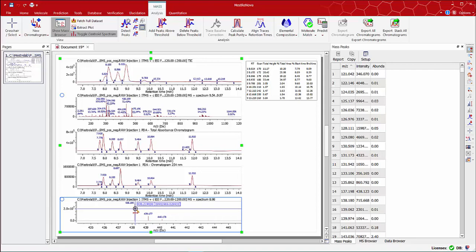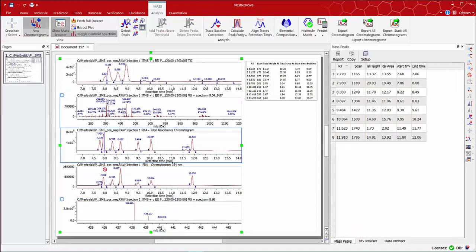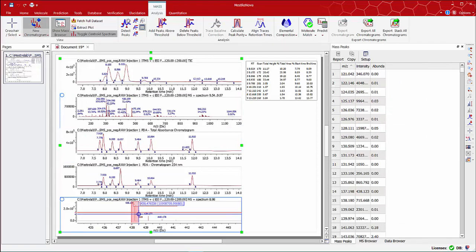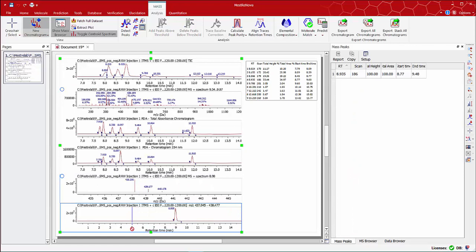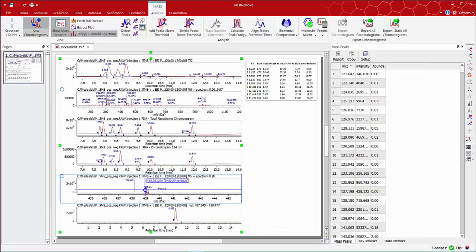Then select the New Chromatogram tool from the main toolbar and drag the desired area along the peak. Now you can see the extracted ion chromatogram, correspondent to that mass range we have just selected.